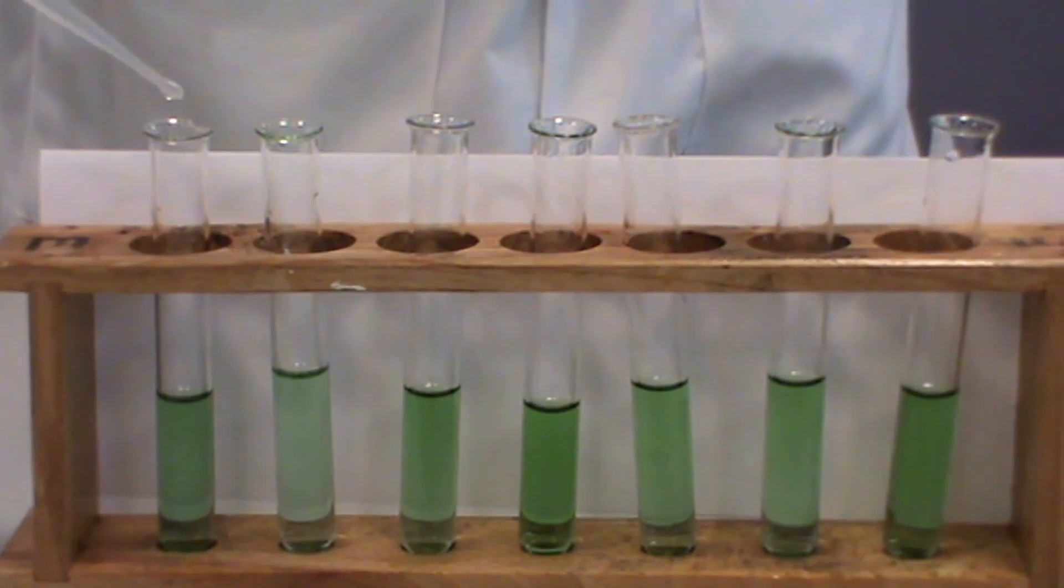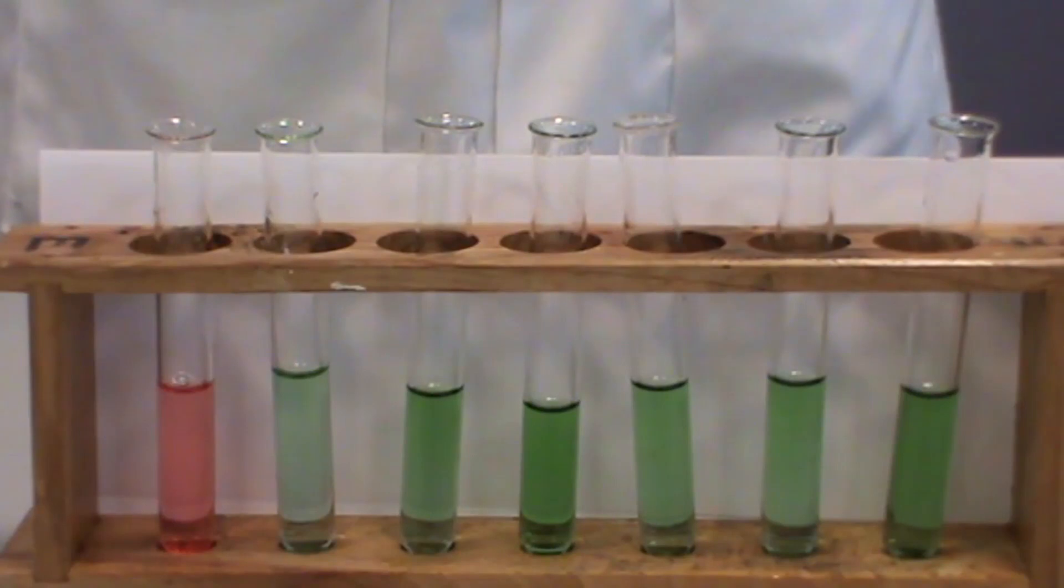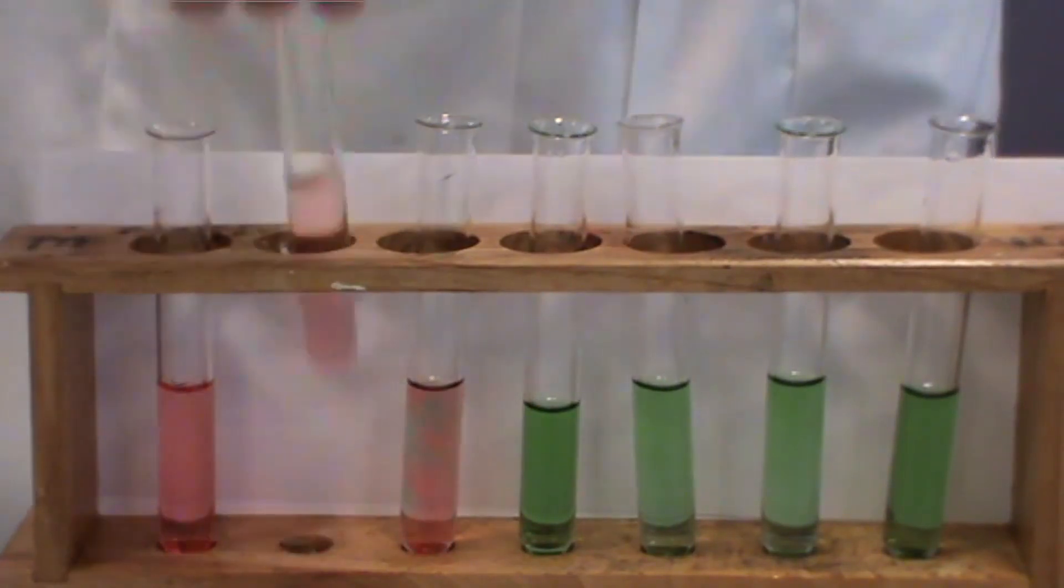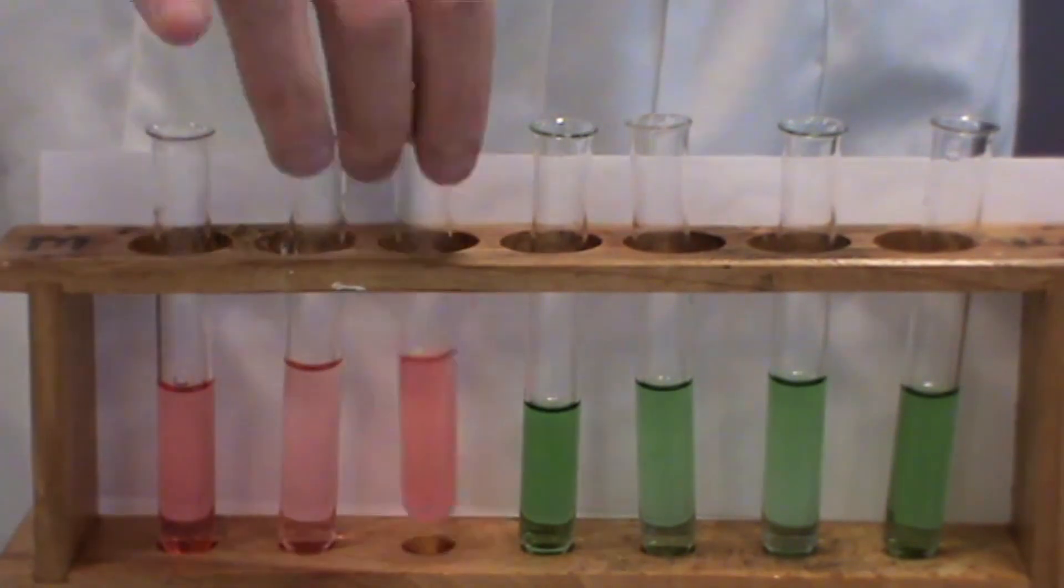Now we need to prepare our initial acidic and alkaline solutions. Several drops of hydrochloric acid are added to three of the test tubes. These are then shaken up to produce a red colour, indicating the solutions are very acidic.